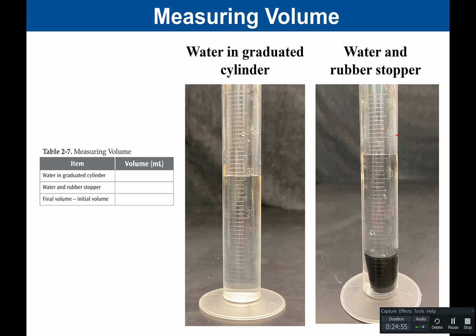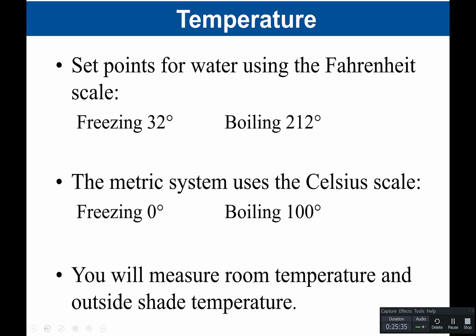And it gets to the point where if you filled it too much and you get in and your volume is big, that could make the water overflow because your volume is displacing that water. So that's showing that we can measure the volume of the rubber stopper by the amount of water that it's displaced.